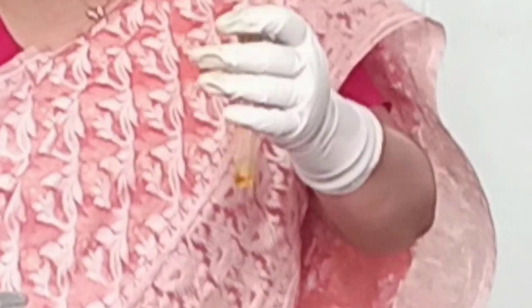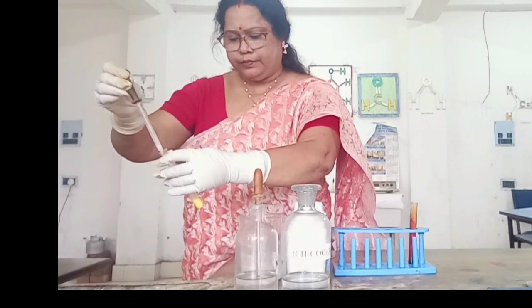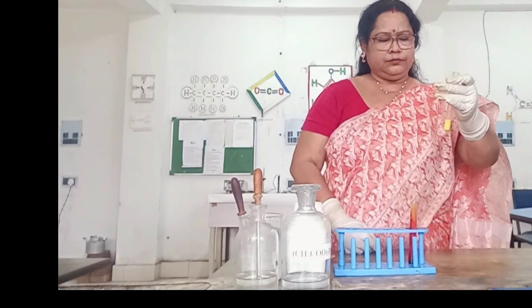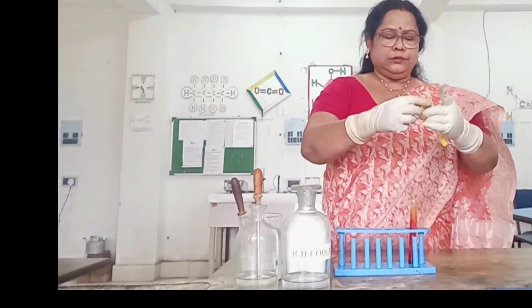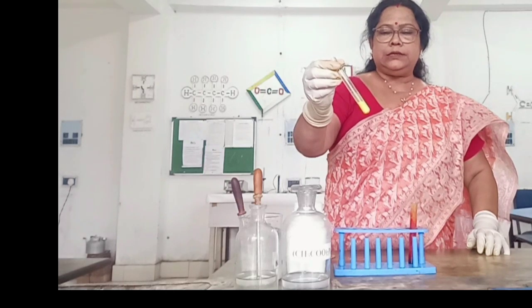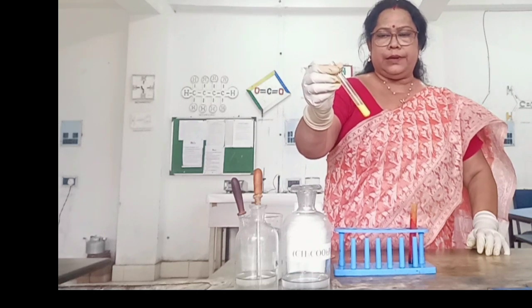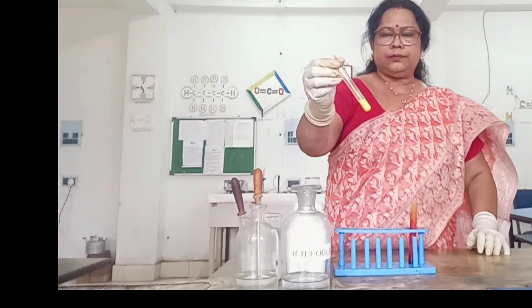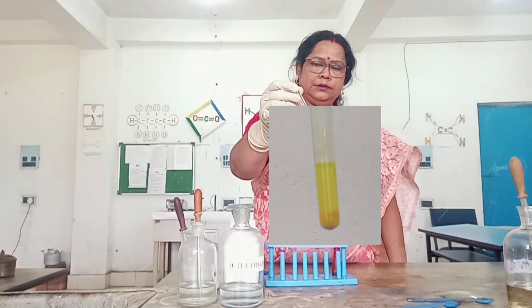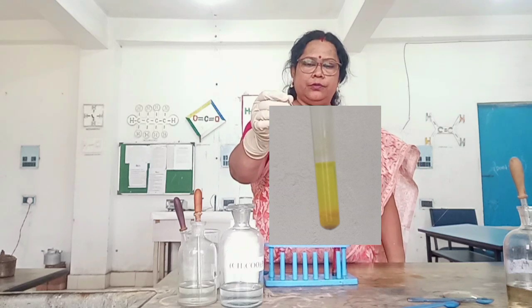Then add a few drops of lead acetate solution. Sodium chromate reacts with lead acetate solution to form a yellow precipitate of lead chromate. You can clearly see the yellow precipitate of lead chromate. Thank you.